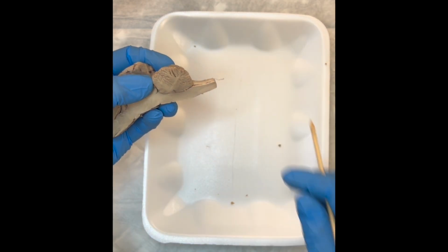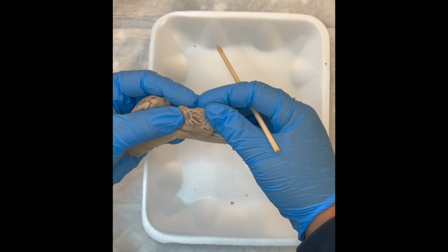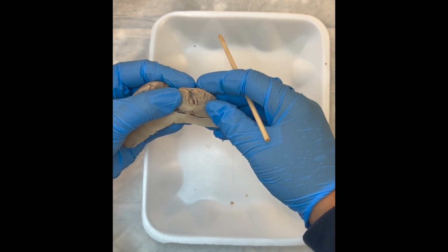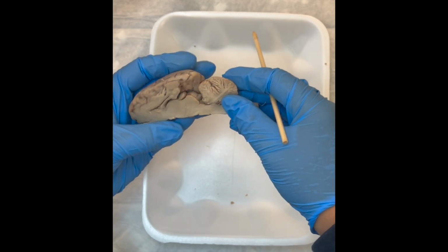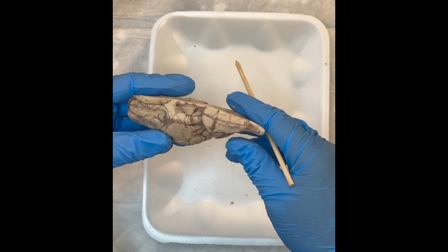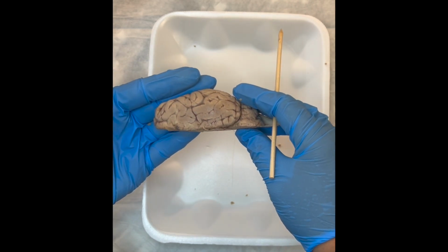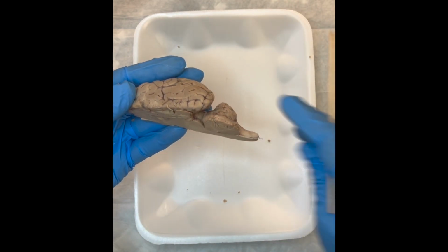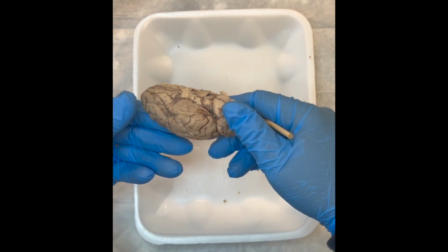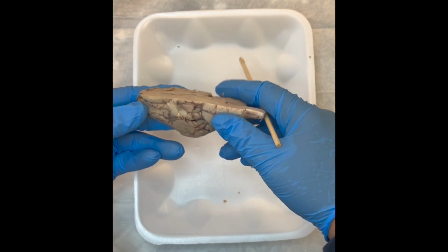So pretty cool. You can make some additional cuts to take a closer look at that, expand the tissue, right? It's a very cool arrangement of neurons within there. So make the most out of this dissection for yourself. Look around, look at your dissection mat or that labeled piece of paper that came along with your distance learning lab kit. And I hope that it was a good dissection for you to understand the anatomy of the brain.